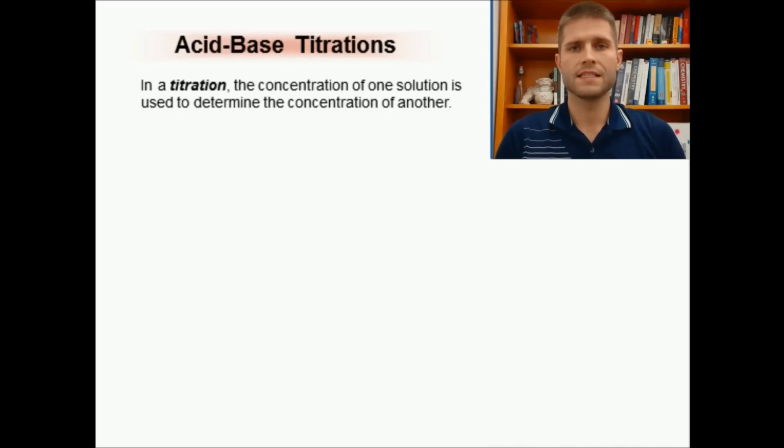So what is a titration? A titration is when the concentration of one solution, generally the base, is used to identify the concentration of a secondary solution. In most cases, it's usually going to be the acid. So how does this work? What types of techniques do we use?